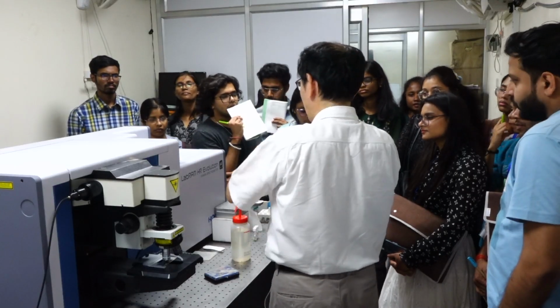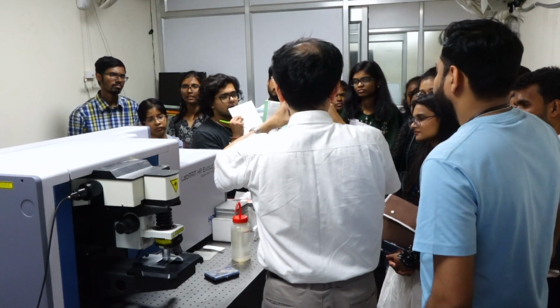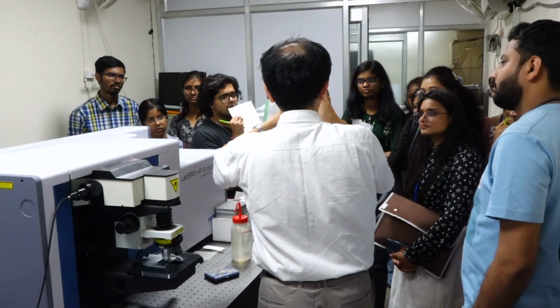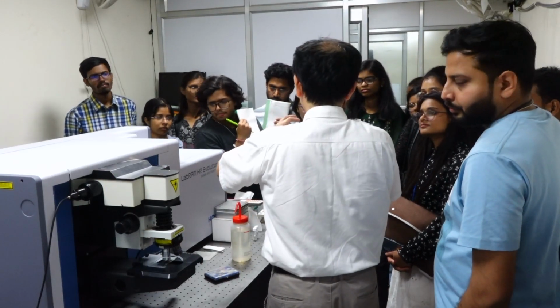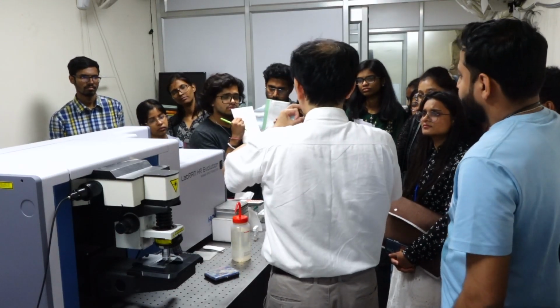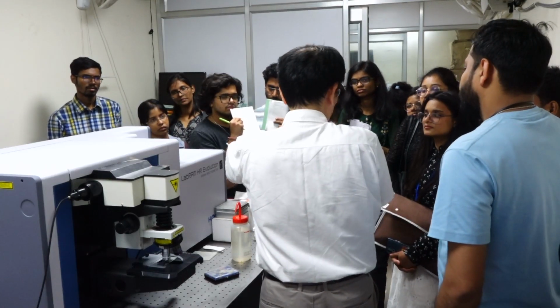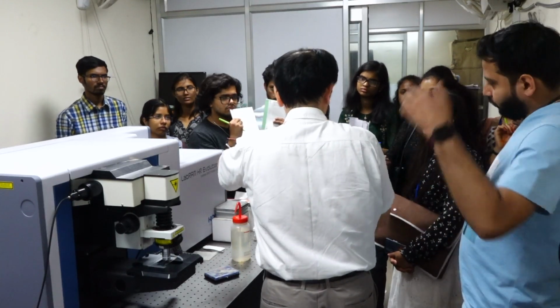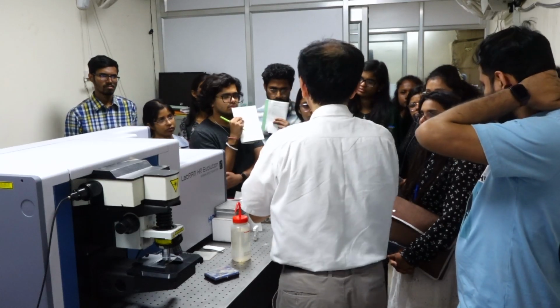The advantage of CCD is that a detector array, a two-dimensional array of detecting elements, is gathered. Instead of this, we can use a single channel detector. But in this case, only one wavelength is detected, so we need to scan next. It will take more time, right? And the CCD can measure different areas simultaneously.